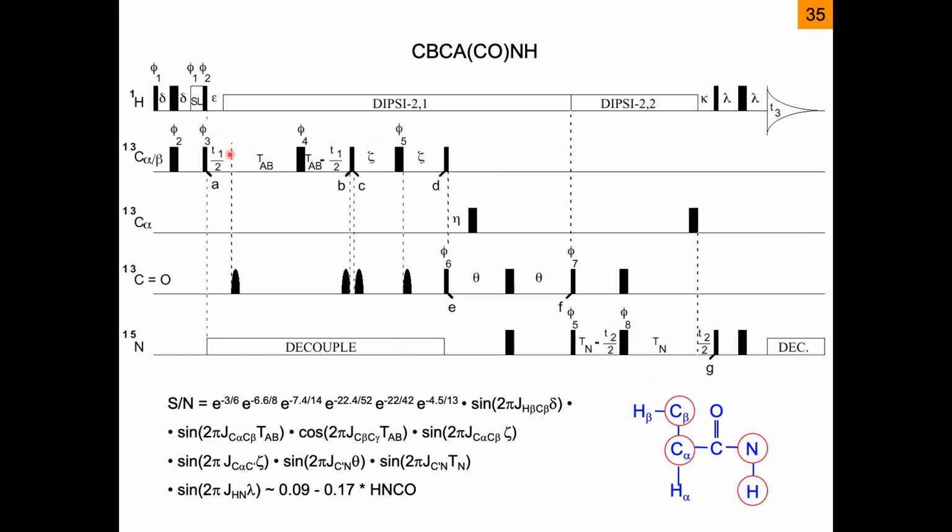This is the cosine term in this magic formula, if you have the right delays. So you stay on C alpha. Here you stay on C alpha, but then defocus to the carbonyl. So this is another pathway in this experiment, and you detect basically both frequencies, C beta and C alpha.